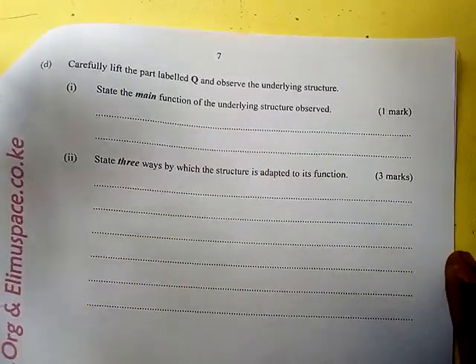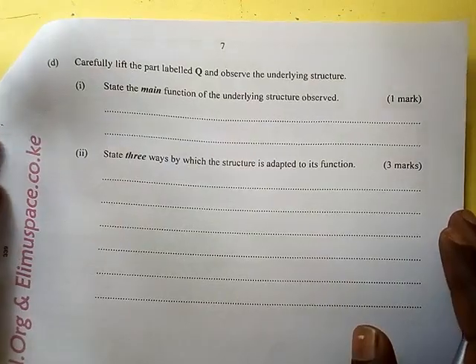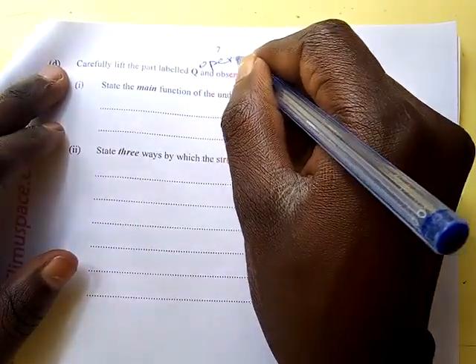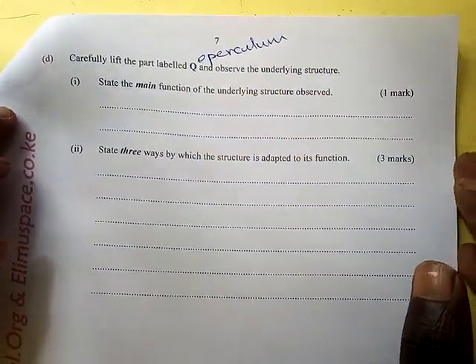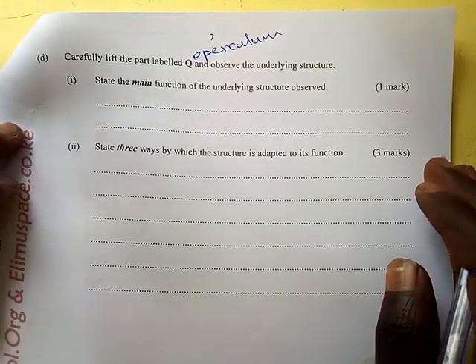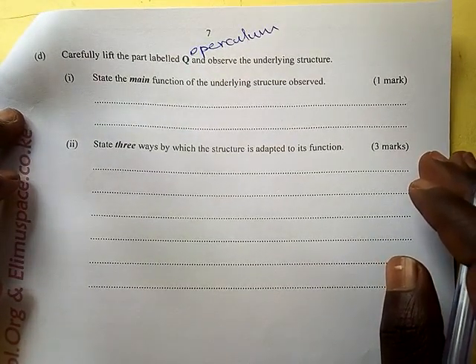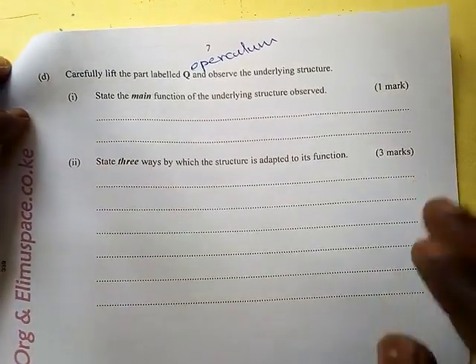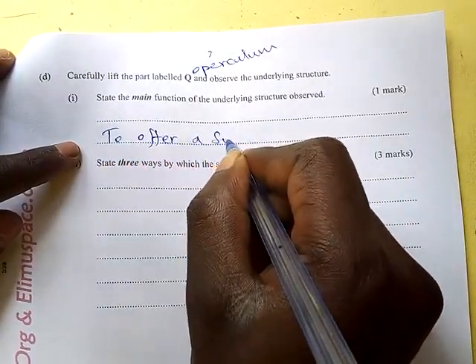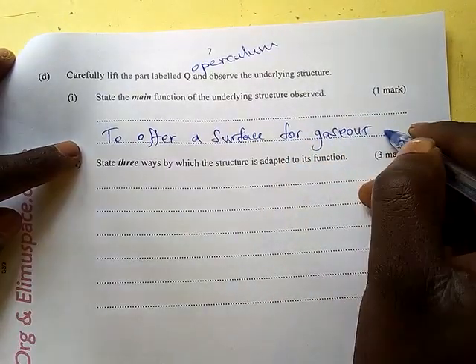Now D says carefully lift the part labeled Q and observe the underlying structure. I've told you Q is the operculum, and you know that below the operculum are the gills: gill filament, gill raker, gill bar. State the main function of the underlying structure observed. The function of a gill is to offer a surface for gaseous exchange.